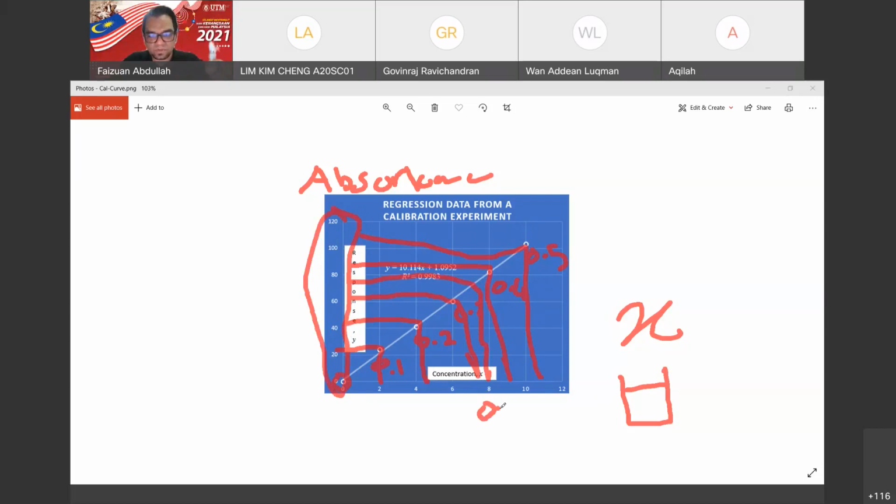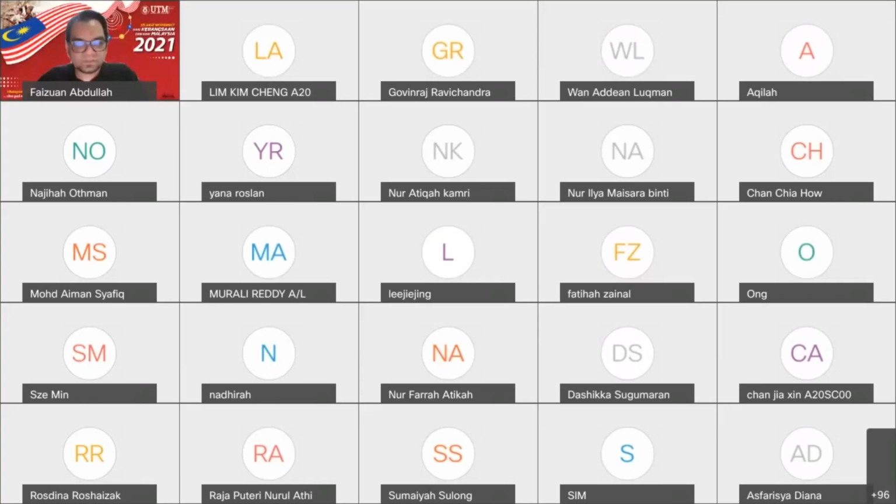So the instrument knows this is 0.35 ppm. This is the use of the calibration solution. We teach the instrument how to know the concentration based on the response. In this case, AAS, the response is absorbance. So what happens with the standard addition?